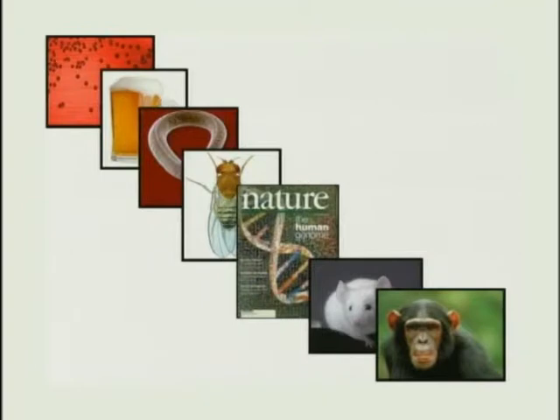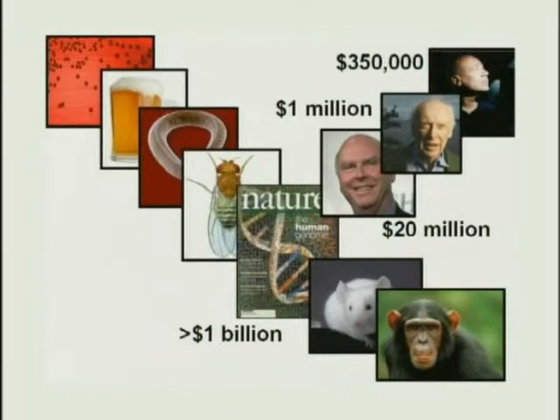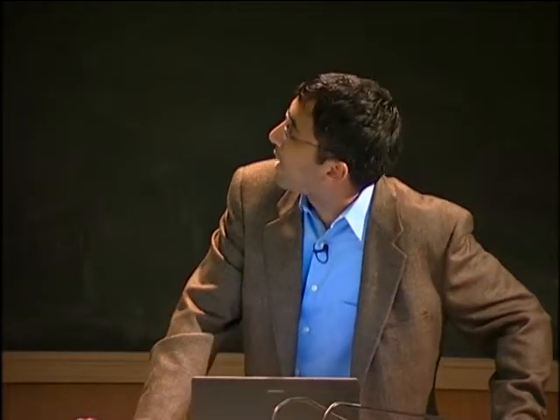So the basic idea here is that, branching off the Human Genome Project and the model organisms that had their reference genome sequence, we can now sequence genomes of individuals for which a reference is available. And the cost of sequencing individual genomes has dropped considerably in just the 8 or 9 years since the Human Genome Project was completed. And even this slide is a bit outdated.